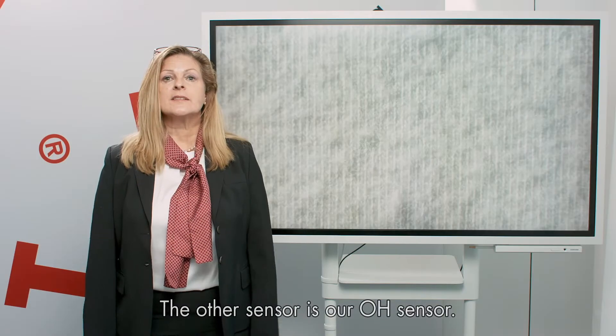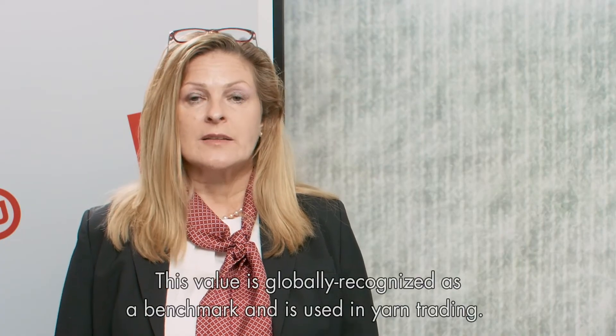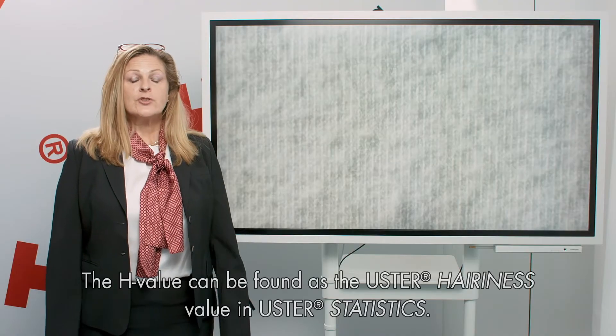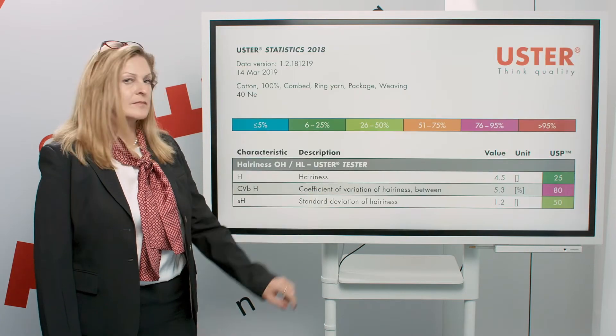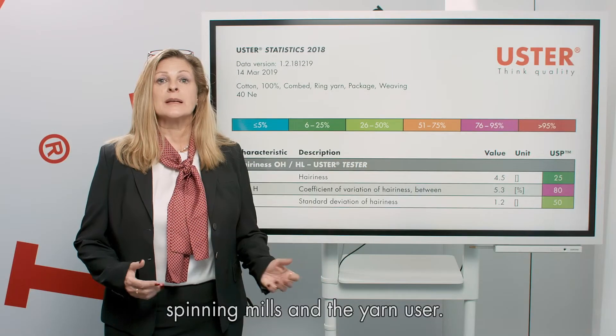The other sensor is our H sensor. This sensor measures the H value, which is globally recognized as a benchmark and is used in yarn trading. The H value can be found as Uster hairiness in the Uster statistics. This information helps users get a better understanding of yarn quality and builds the bridge between the spinning mill and the yarn users.